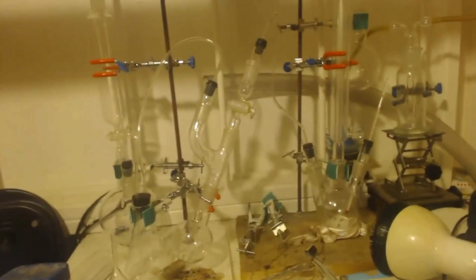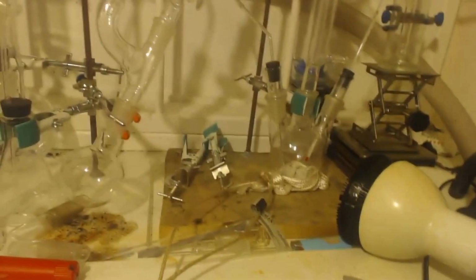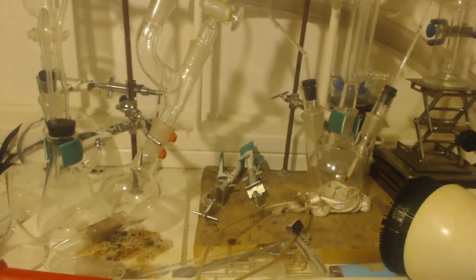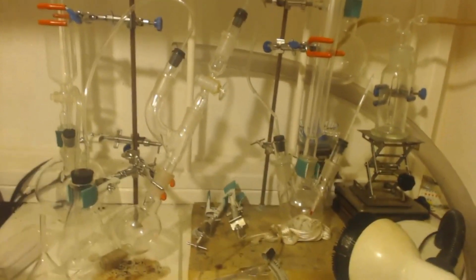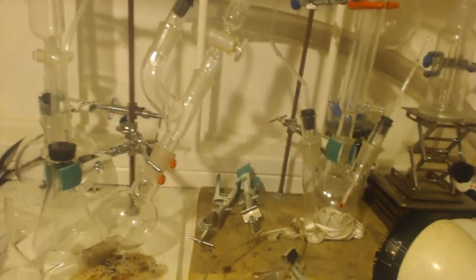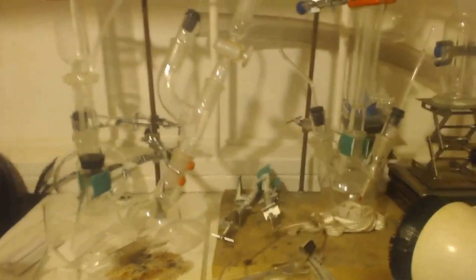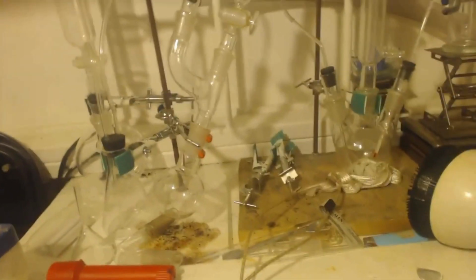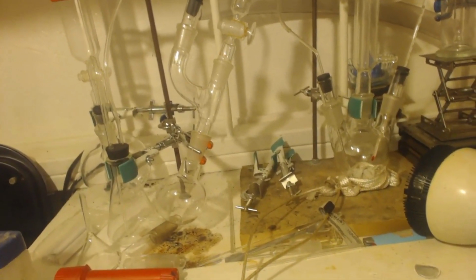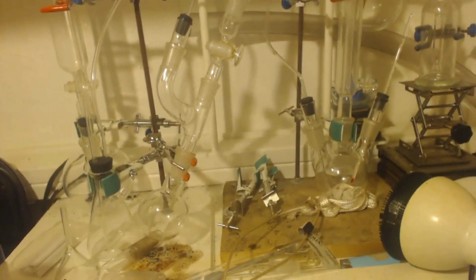My blue light is actually, I think, 450 to 460 nanometer blue light. There is no UV produced by it, and so it's mainly all going to be blue. So we'll see if it works or not. I say it will. I say UV is too much, but maybe not in this reaction, but in a benzyl chlorination reaction using free radicals, UV is too powerful. So let's get the stuff in there and get it going.